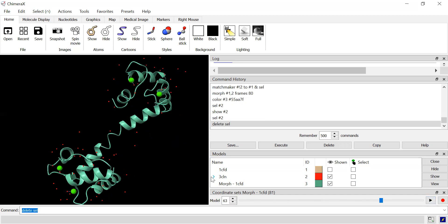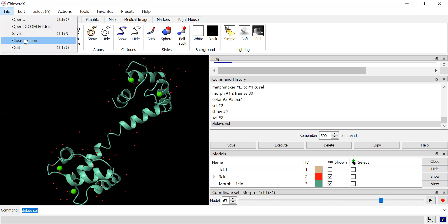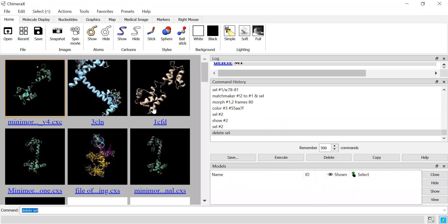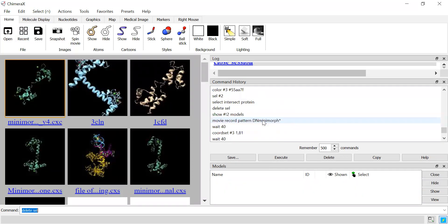Now, let me start this over because there's an easier way to do it using just the command line. It's even faster. It's awesome. Just activate hard mode here, inspect from the beginning.